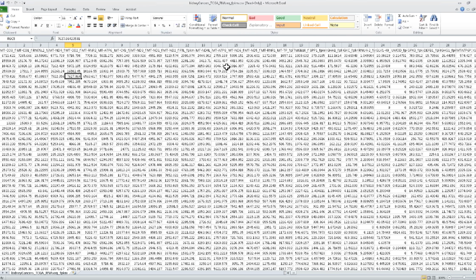So you can either hide that column, or you can convert it to a value and just say, this is my gene ID annotation channel, so as not to cluster on your gene ID or cluster on the ensemble. But yeah, there's lots of different ways of tweaking your data to get it to work.